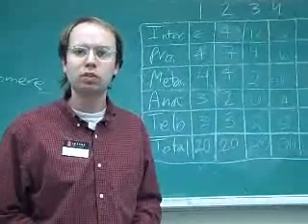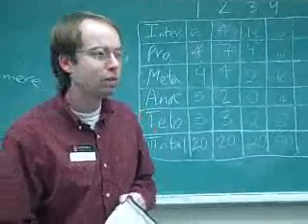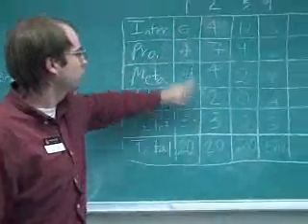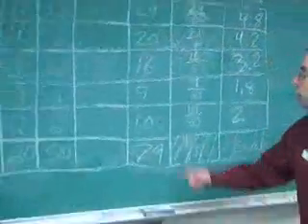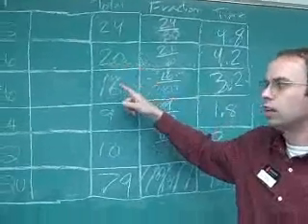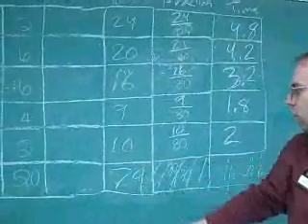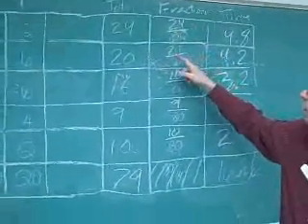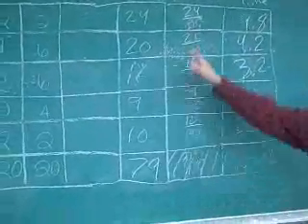We decided how many of those 20 were in each particular stage, and we got a fraction from it. So this is our group data for one of our classes. You can see this is for one group, another group, and so on. Here are our class totals. Out of 79 cells, 24 were in interphase, 20 were in prophase, 16 were in metaphase, 9 were in anaphase, and 10 were in telophase. So we just turned this into fractions, like 24 out of 80, 21 out of 80, 16 out of 80, and so on.